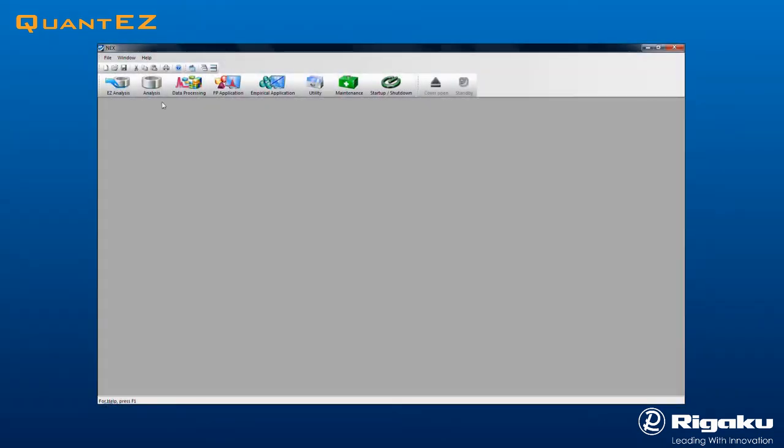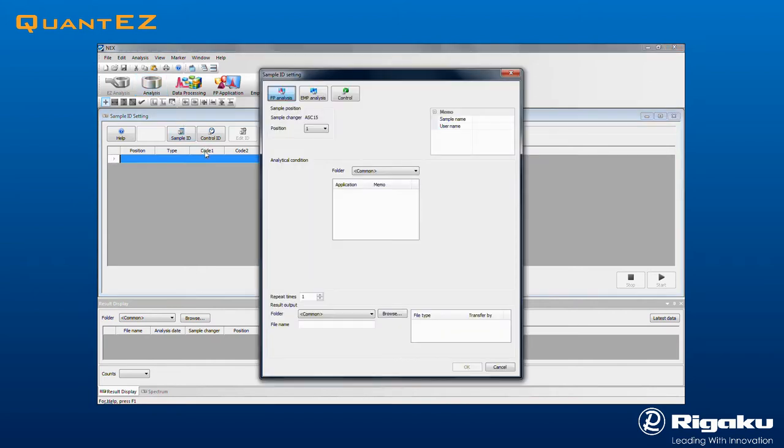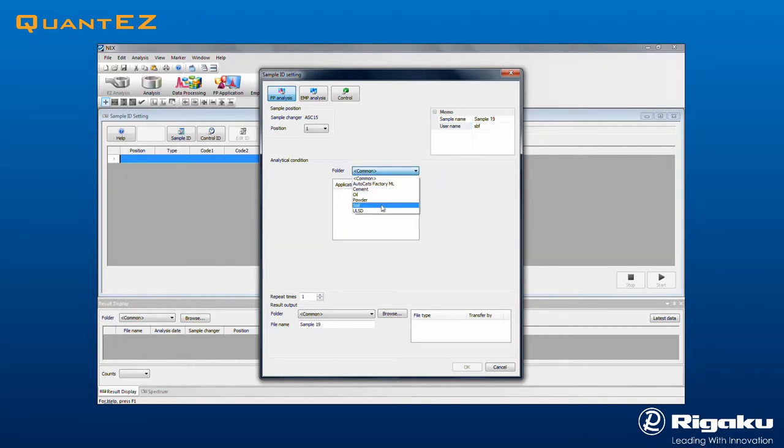Click the Analysis icon to open the Sample ID Settings screen. Double-click the blue bar to open a dialog box. Then select the sample position and enter a sample name. The operator name may optionally be entered. Select the data folder and application.